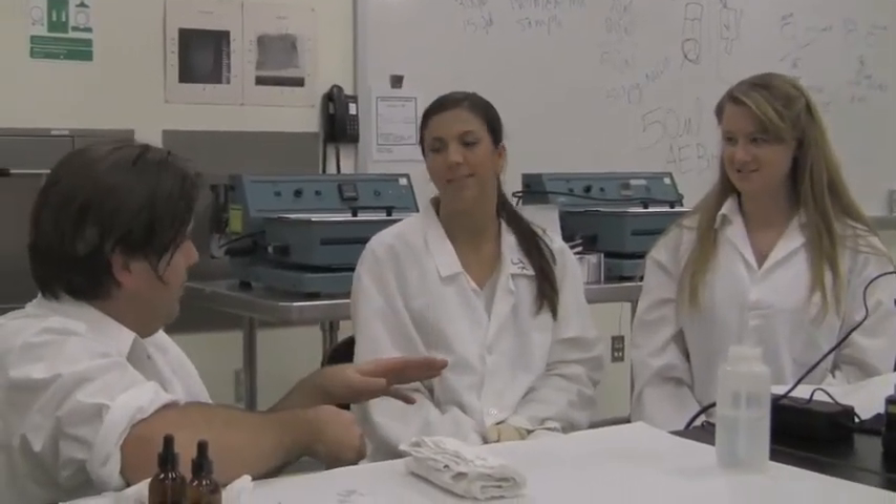You're both graduate students here in the criminalistics department at Cal State L.A., both in your second year of your master's program. Kristen, tell us about your research. My thesis research is a comparison of conventional methods for detecting semen evidence compared to a newer method called Y-STR technology. I'm hoping this newer technique will be more efficient and more sensitive, able to detect semen evidence at longer time intervals between the act — oral copulation — and the time of collection and testing.